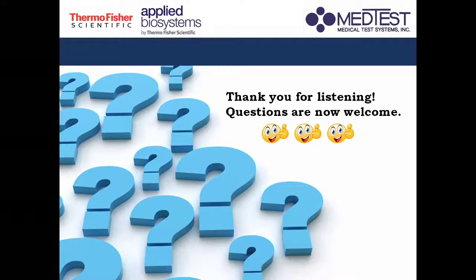But if you really have to, provided that you see that the amplification plot is really very ugly, you can adjust manually. It's in the software. It's kind of hard for me to train, but late next week I will show you how to do the manual adjusting of the baseline and the threshold.